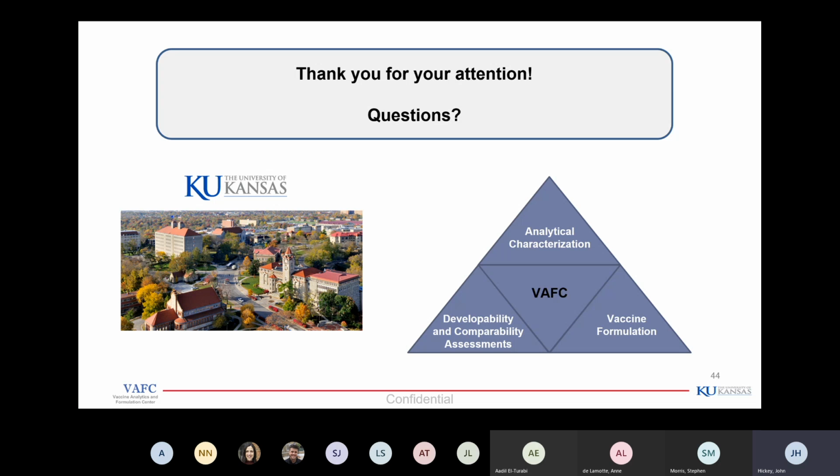It is challenging the more complex the sample is. But I would say the more challenging part is actually not the proteins, but what else is in there. Detergents are a big hindrance towards any MS-based techniques, and small molecule additives can really affect what you can do with it.